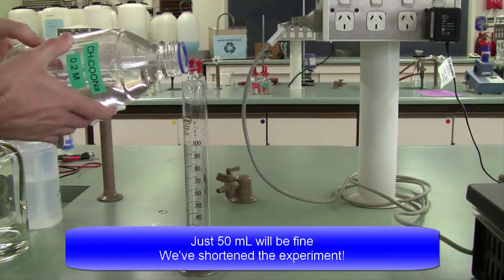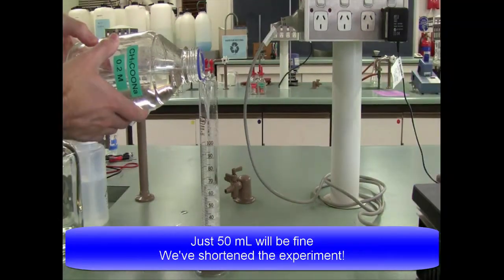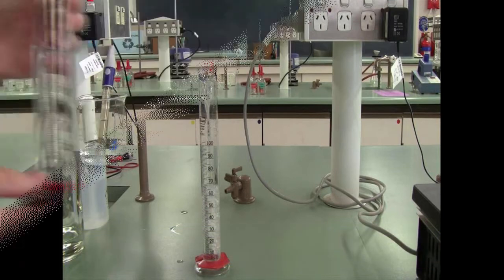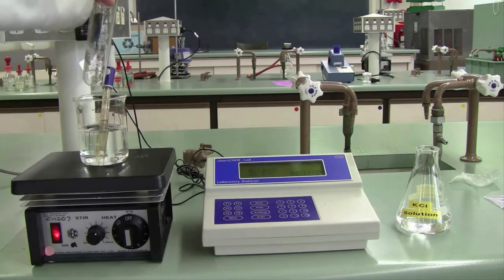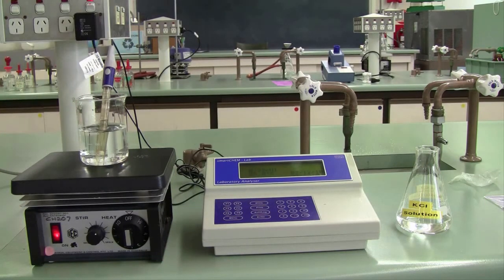Then take 75 ml of 0.2 molar sodium acetate, a weak base, the conjugate weak base of your acetic acid. Add that to your acetic acid, you now have a mixture of a weak acid and its conjugate base, a buffer solution.